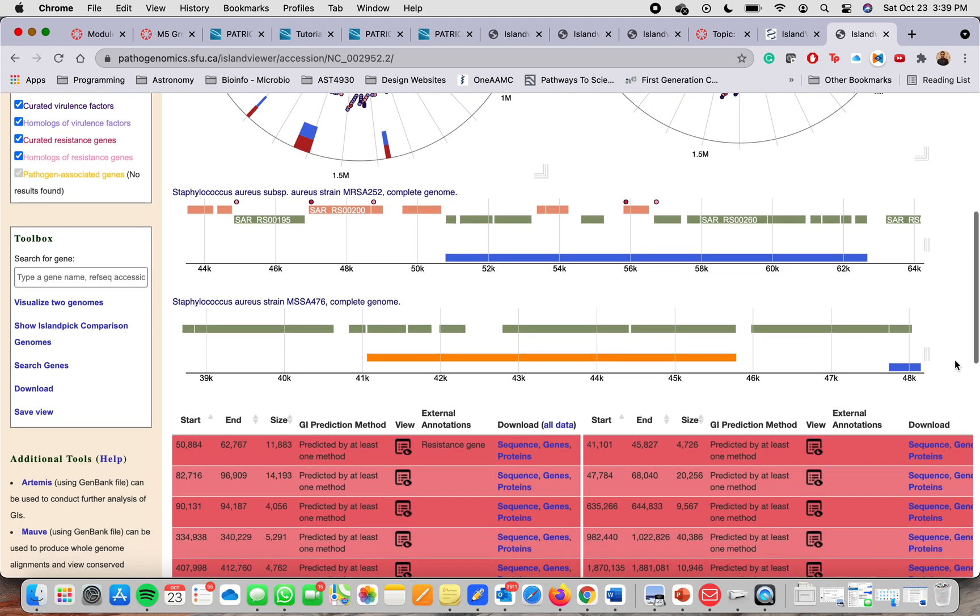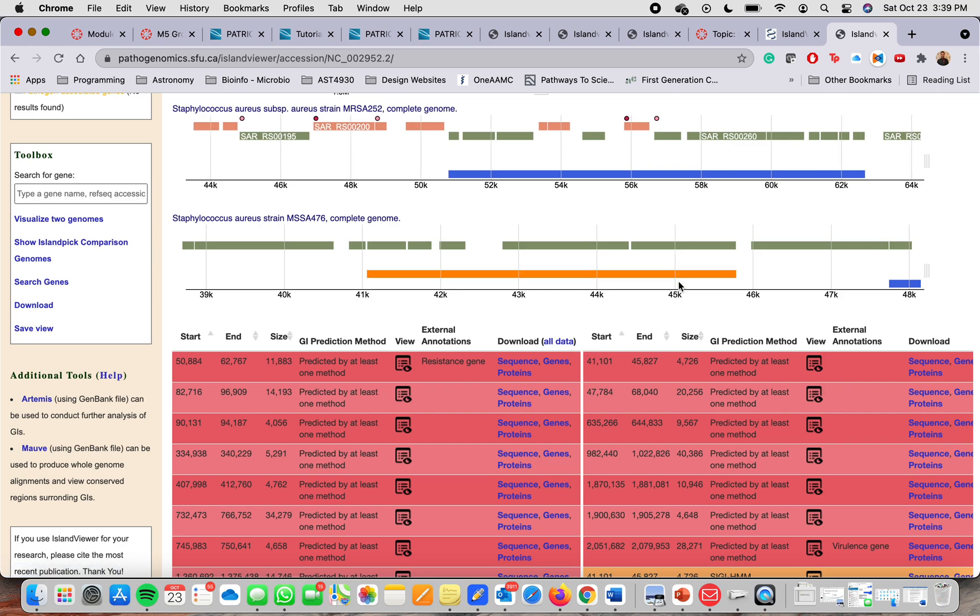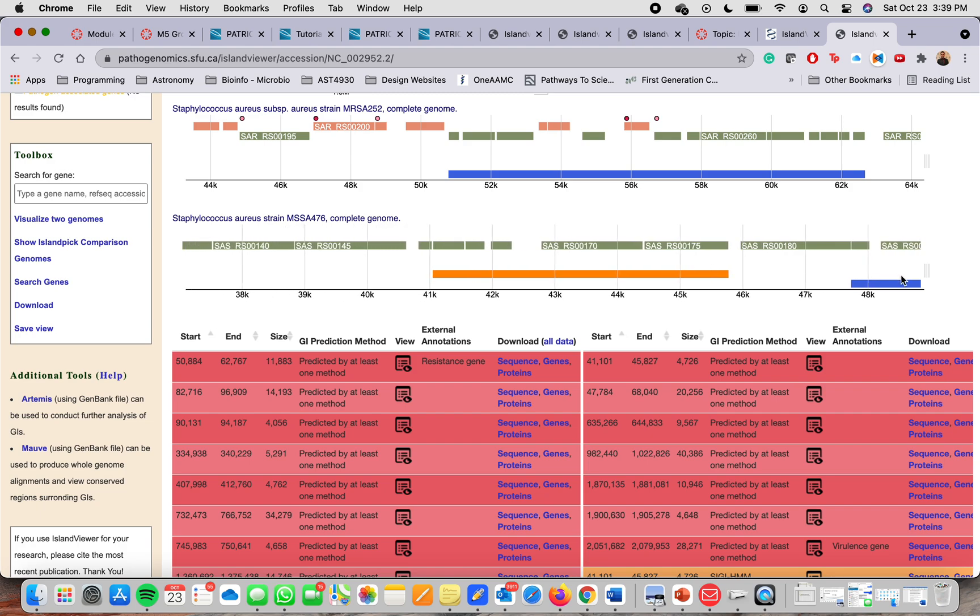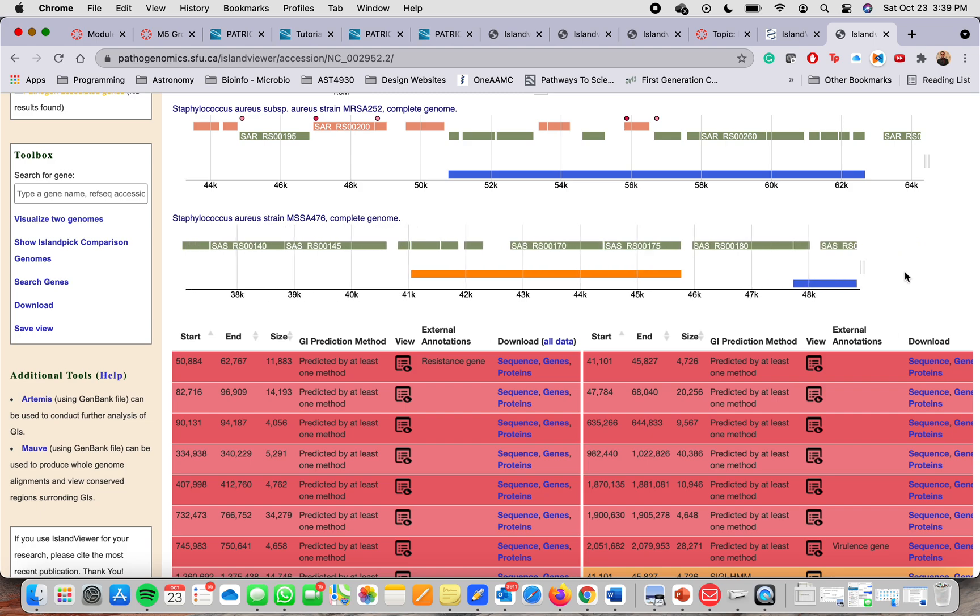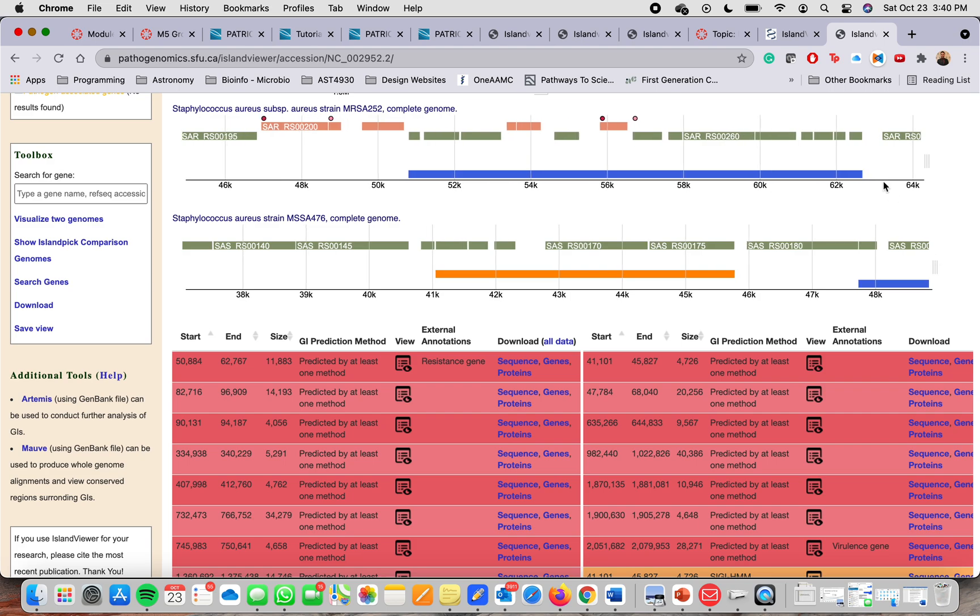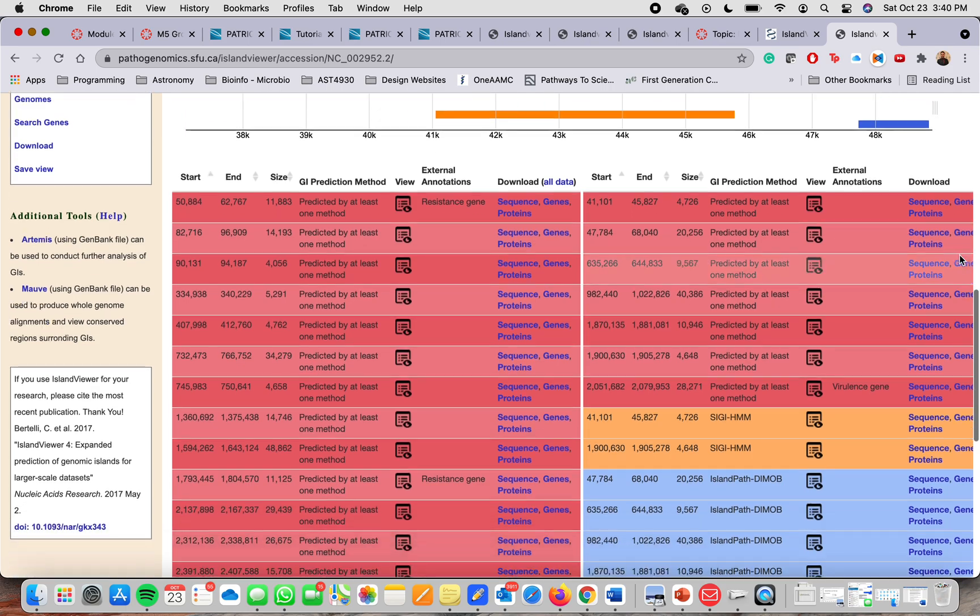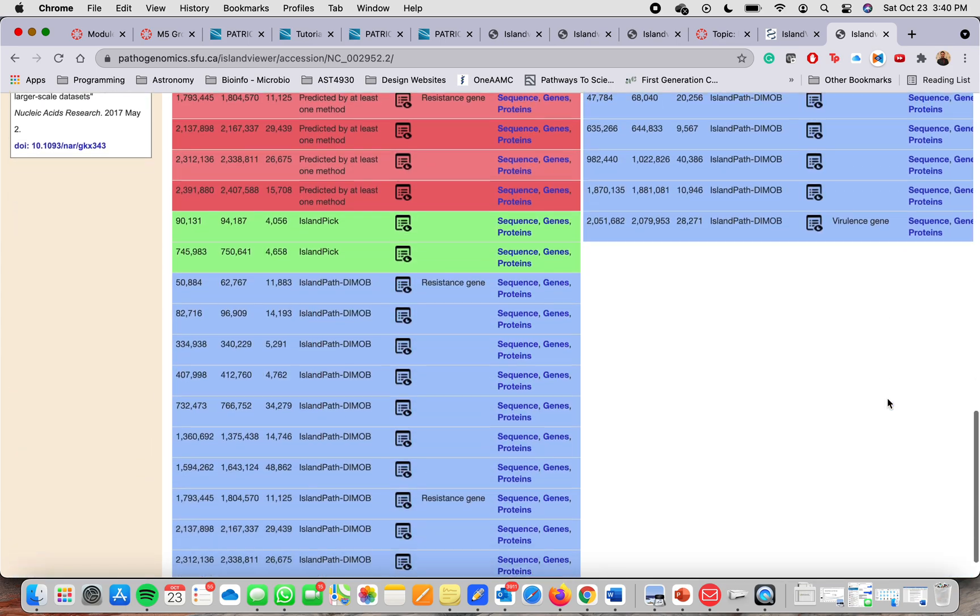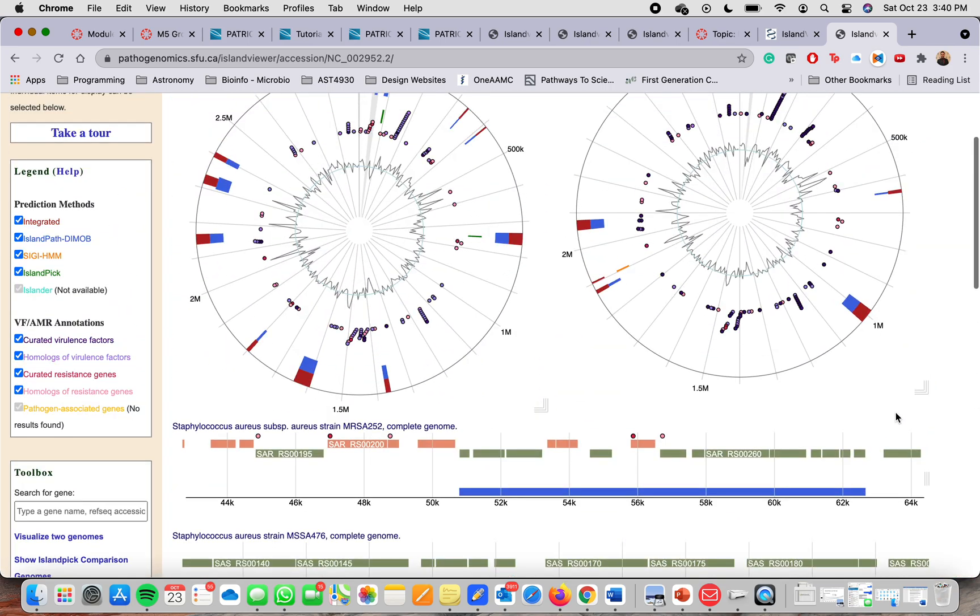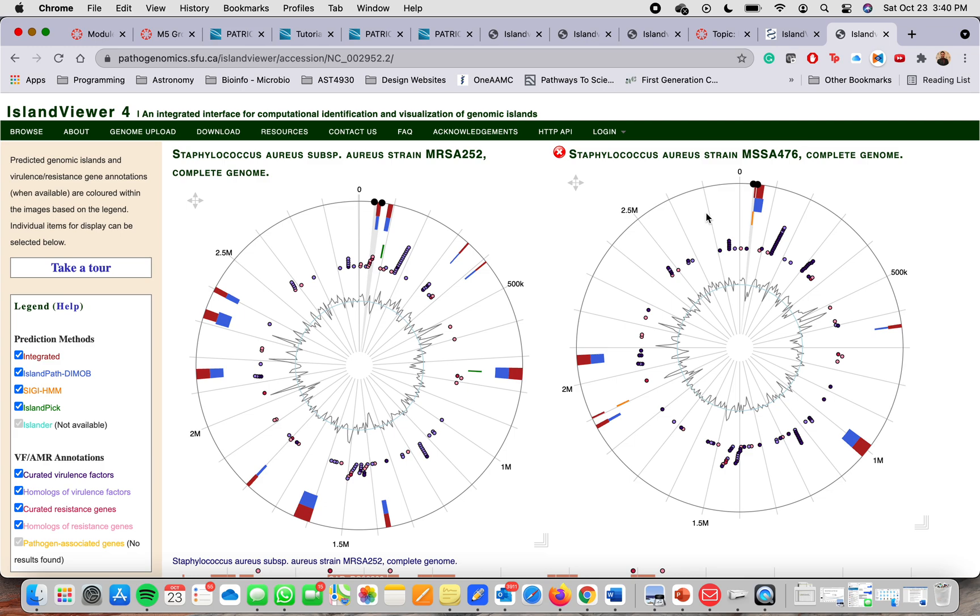And let's see, you can download all the data if you wish. You can go through the whole genome. Here you have the whole genome. You can expand it. You can zoom out or zoom in. And that's how you use this website.